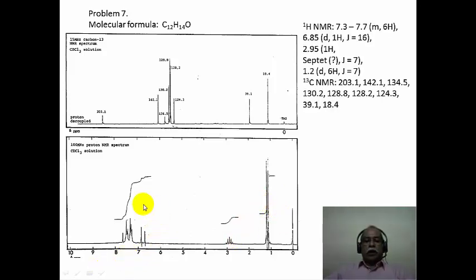So let us go to the aromatic region. In the aromatic region, it looks like there is a part of an AB quartet which is chopped off from the rest of the spectrum. There is a roof effect you can see, an unequal intensity distribution. And this integration here suggests that this part of the integration is essentially the same as this part of the integration.